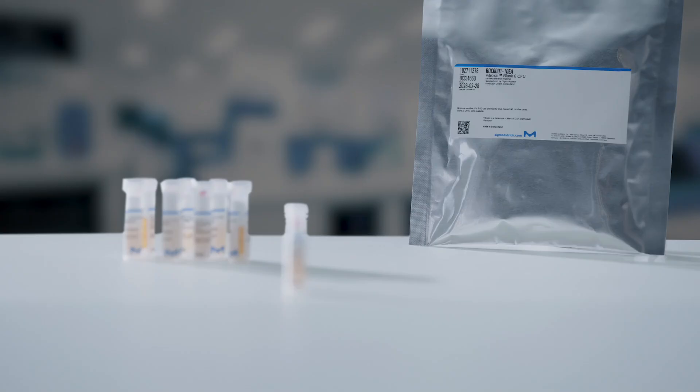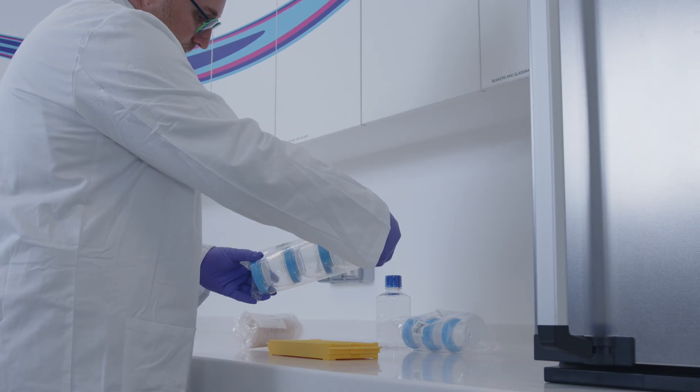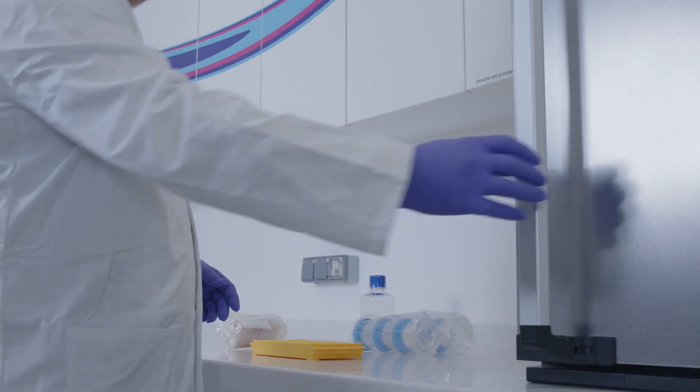The microvials come in a waterproof mylar foil bag, each containing 10 vials. The bags can be stored at minus 20 degrees Celsius.